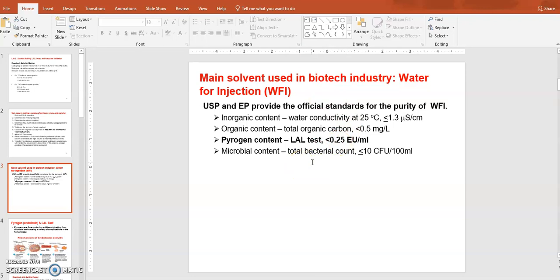Okay, so the second exercise is about the water that you will be using in the lab or using during your manufacturing. Okay, so if you are working in a pharmaceutical industry, water is really important because you will use so much water during your manufacturing. So upstream process, you will grow your cells in some kind of growth medium, and growth medium's base is water, of course, right? And the downstream process, again, you will have to use a bunch of different solutions, buffer solution or binding solutions or washing solution or elution solutions. So water will be used everywhere.